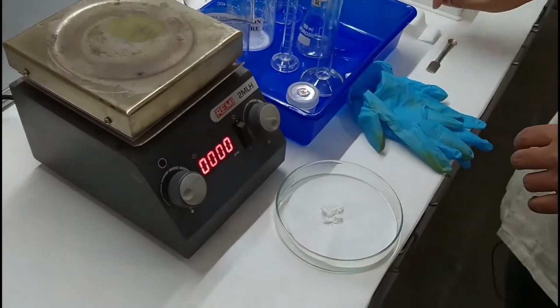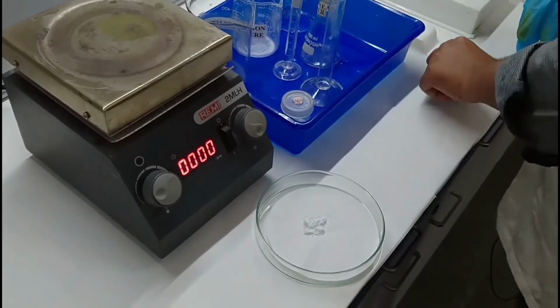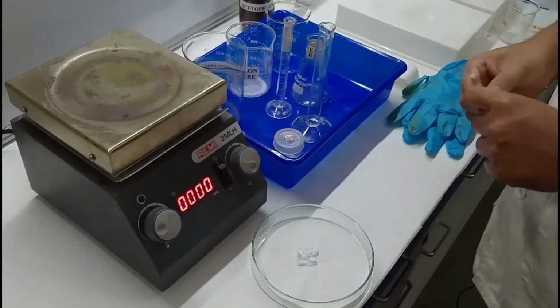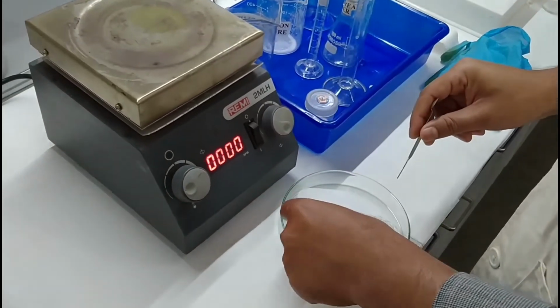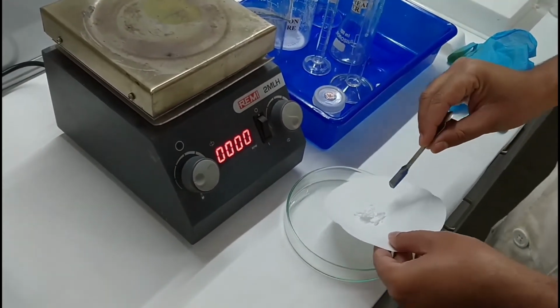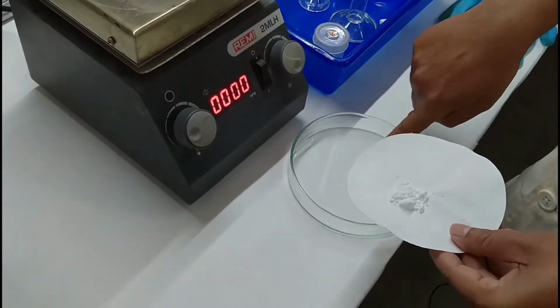Now we are going to transfer all this white substance into the plate.